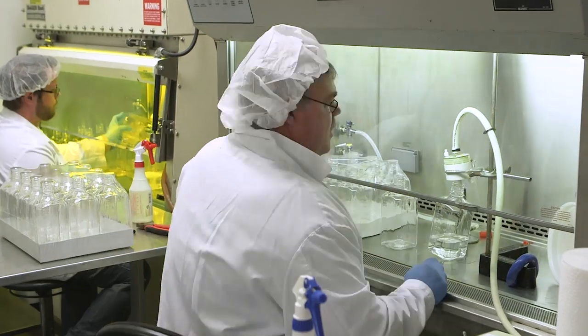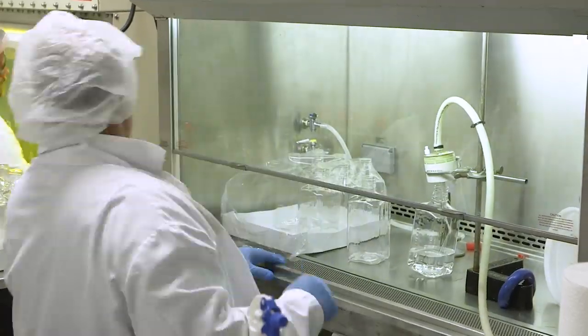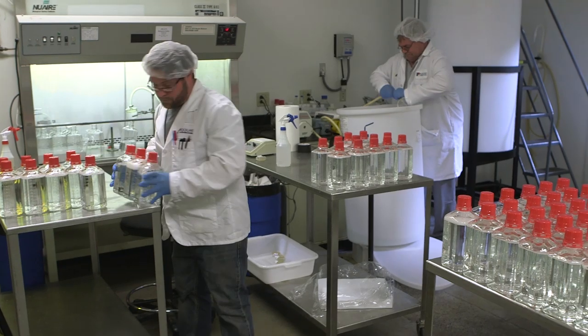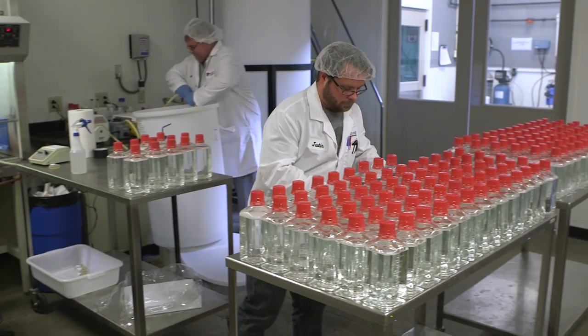From the monoclonal development suite, selected clones by the customer will be pushed into production suite where they will be cultured, expanded, and banked in different volume sizes for different antibody production growths.